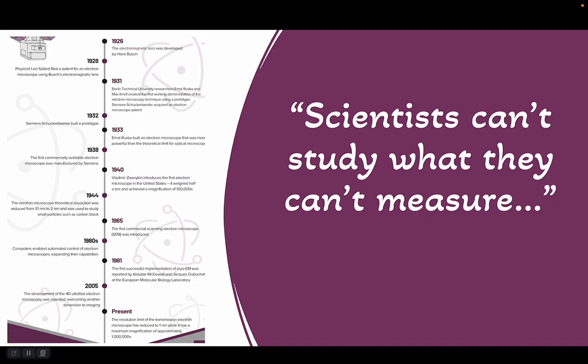Without microscopy, there's no modern science. Indeed, scientists can't study what they can't measure. They wanted to see more than what the naked eye would allow. Microscopes have come a long way since their first version of a simple magnifying glass that was introduced centuries ago to what we now have, such as SEM, TEM, and other advanced microscopes to view structures of viruses and proteins in 3D. Isn't it a tremendous progress?